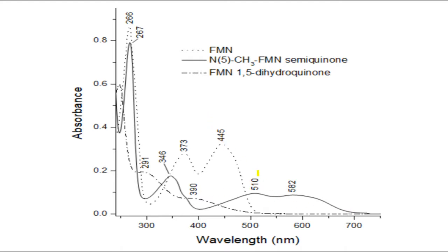So from this graph, we send light at 700, 650, 600, all these wavelengths of light, and we see how well it absorbs. And the device will tell how well it absorbs. And by which wavelength it absorbs at and how much it absorbs, we can differentiate between these 3 different species. So that is what they call spectrometry or spectrophotometry.